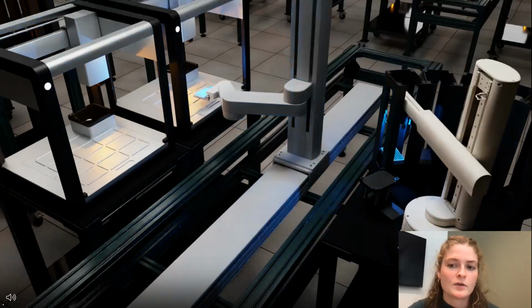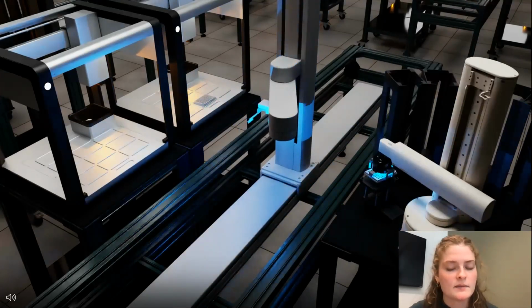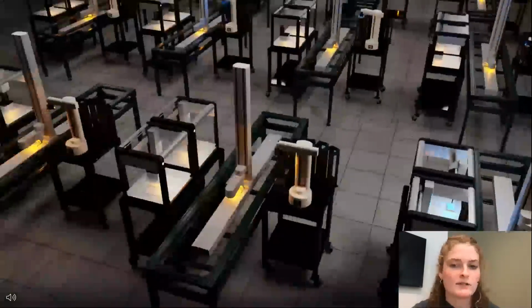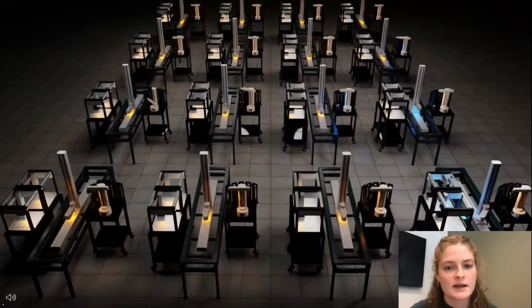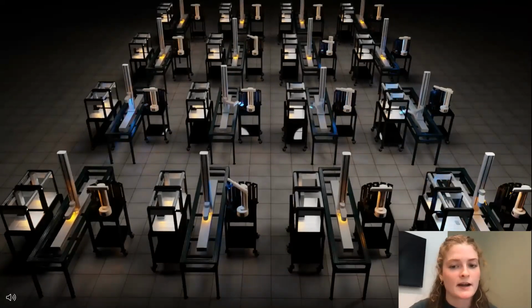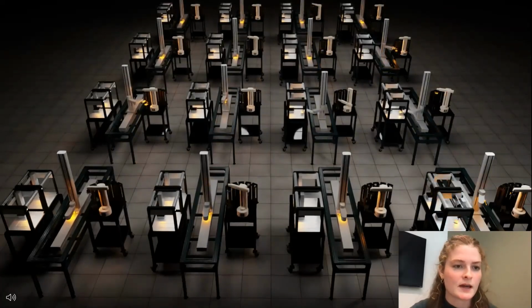We can work on coordinating the movements of the robots so that things are happening at the same time, and it doesn't necessarily have to be just a linear set of actions, so that we can take better advantage of the time that we have and not keep our expensive instruments idle for too long. Also, we can think about how we would design a larger science factory and how we would get these pieces working together and how we would coordinate them before we have to make that investment.